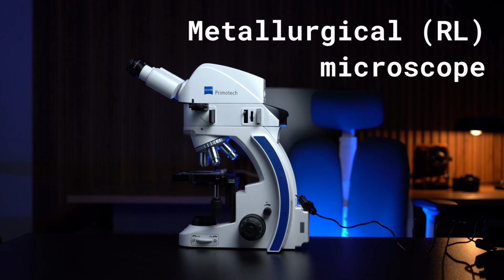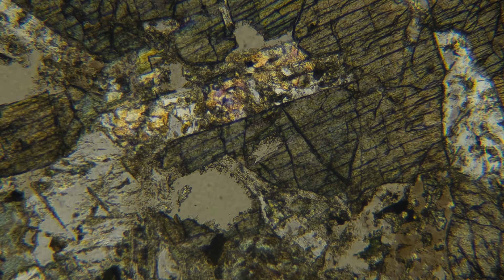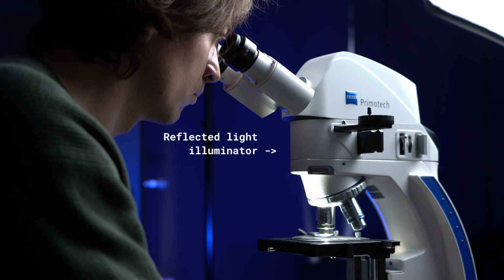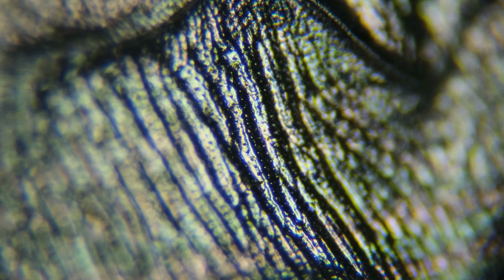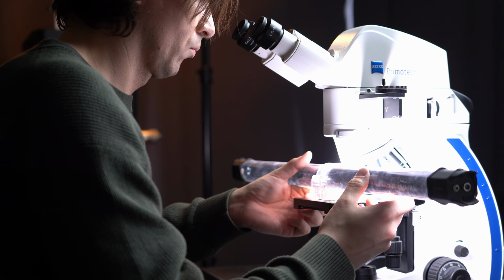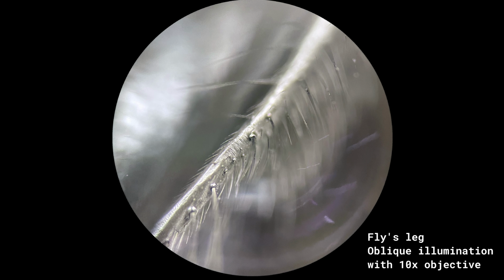Reflected light microscopy. Last thing, if you want to study silicon wafers, polished metal samples or stone cross-sections, you're probably not a total beginner anymore, but still, you'll need reflected light. Now we can observe opaque samples, polished mirrors, metals and similar surfaces, but this doesn't work well for complex shapes. Light scatters in all directions and contrast is reduced. Side illumination sometimes helps at lower magnifications, but for lower magnifications it's easier to use stereo microscope.